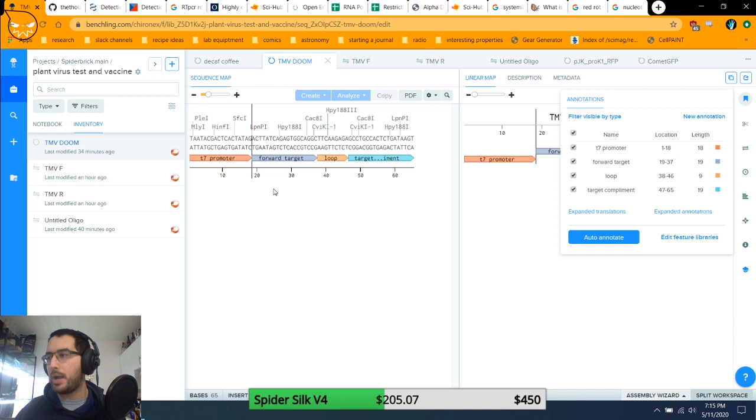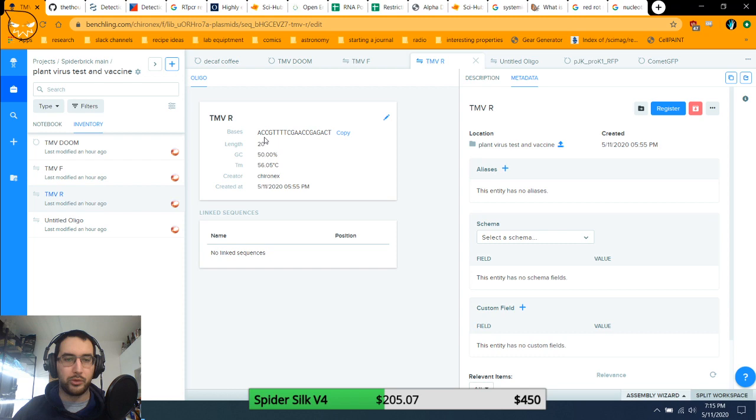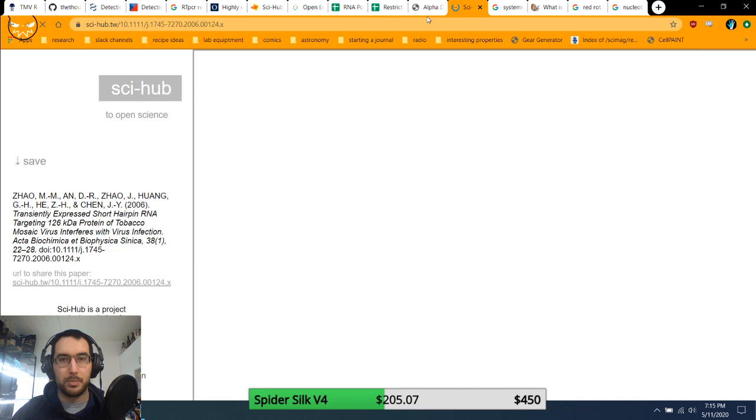Basically, here's the plan. I'm going to order this primer. This is the forward primer. I'm going to order this primer. This is the reverse primer. This should let me, and I need to see if I can find the paper, because I don't know if I left it open or not.